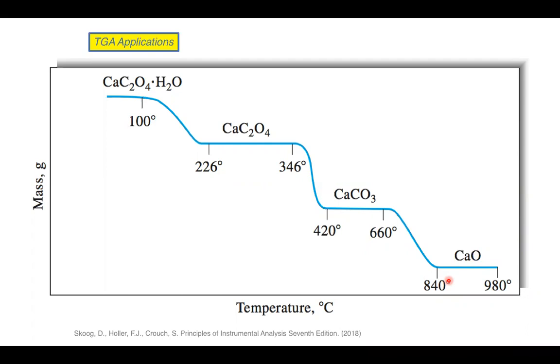So what you're doing is trying to expedite the process so that you don't have to wait 10 years before you bring your product to market. You can do it within a few weeks if necessary. But this is a pretty good model. There are ISO methods out there on how to predict longevity or product life.